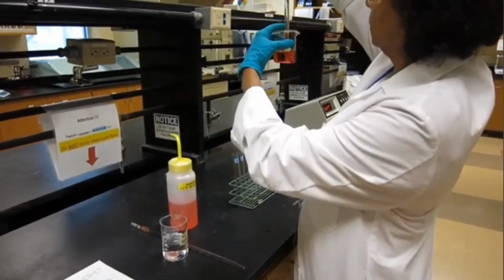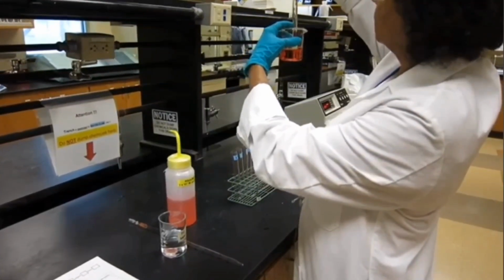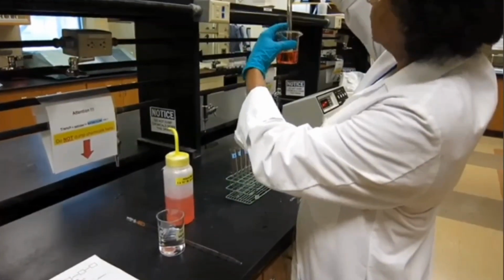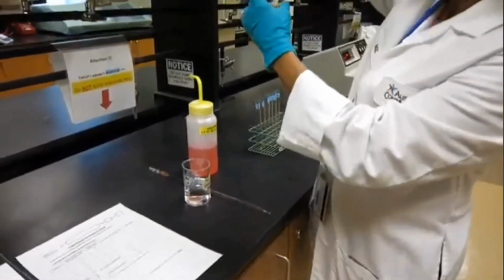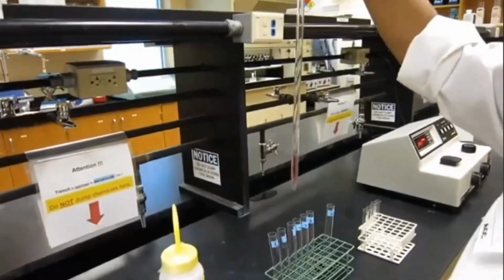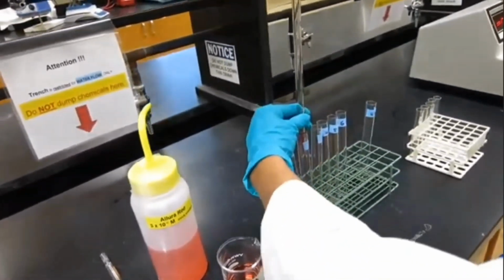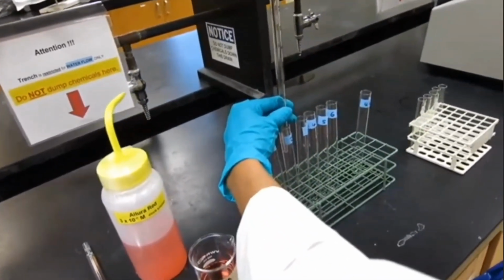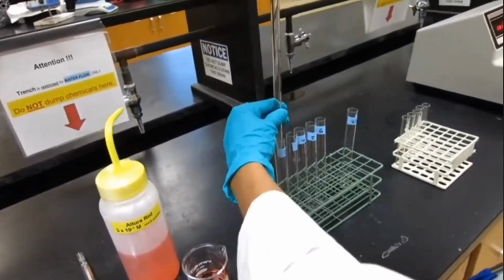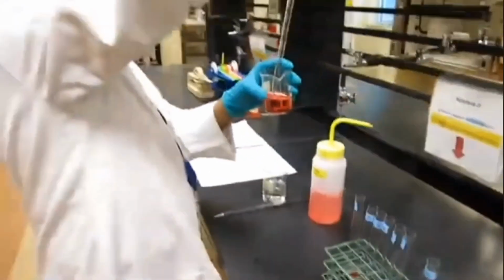The first test tube is going to be just the distilled water and we're going to be using that as our blank. And for the second test tube, we're going to be adding 2 milliliters of Allura red stock solution, which has the molarity 3 times 10 to the negative 5.